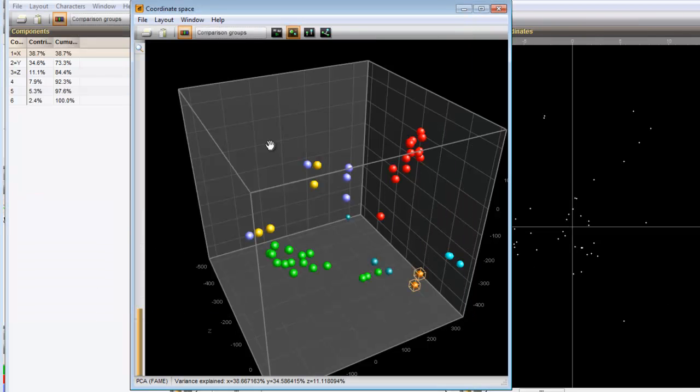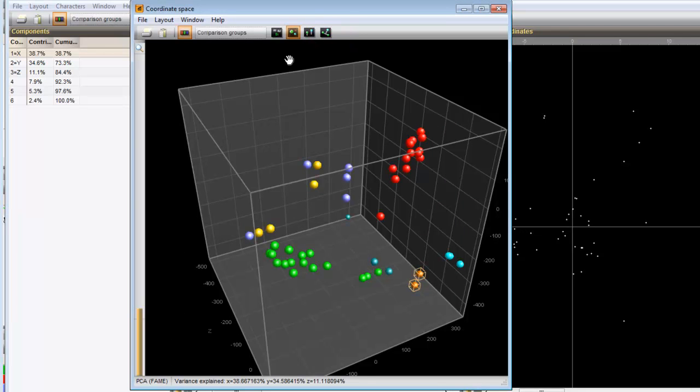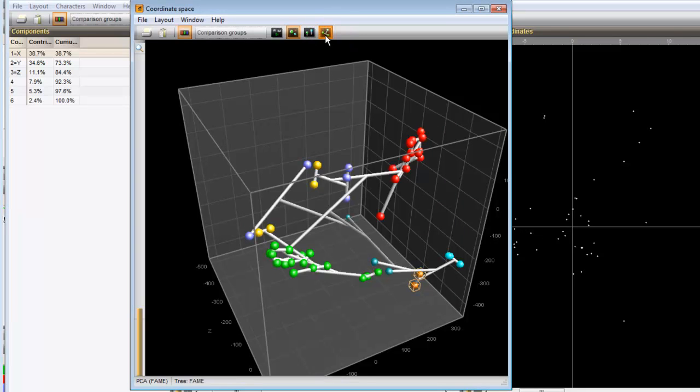An interesting display option can be accessed with the last button. Now the entries in the coordinate system are connected by the branches of the active dendrogram from the comparison window. This is an ideal combination to co-evaluate a dendrogram and the PCA.